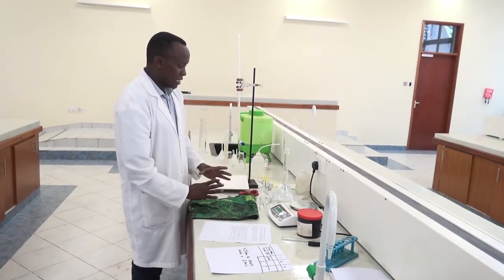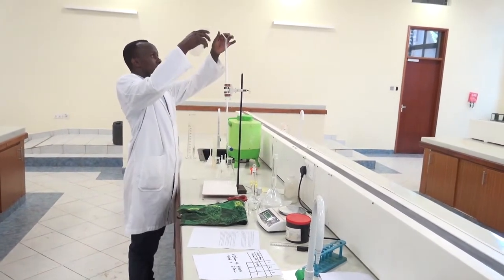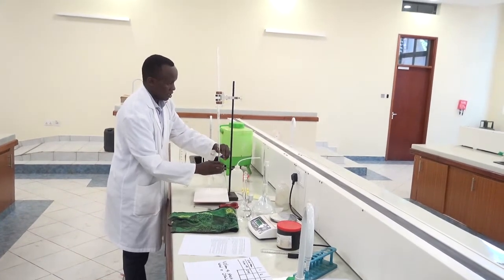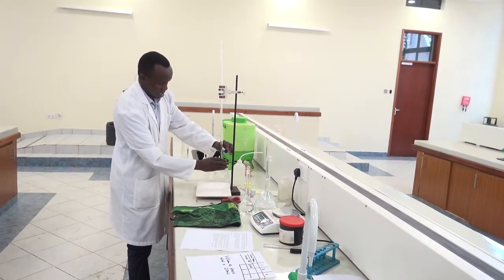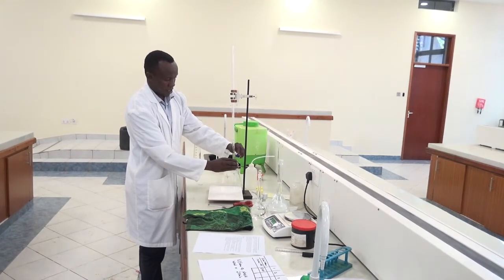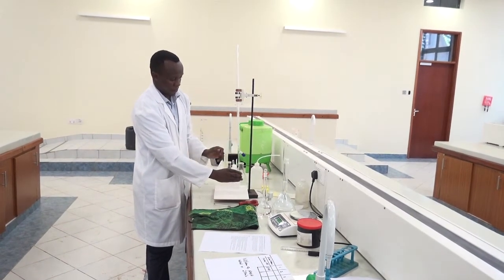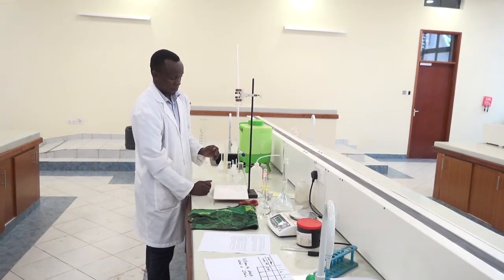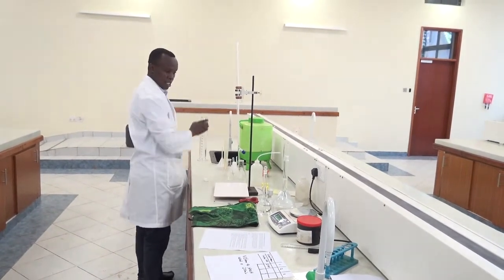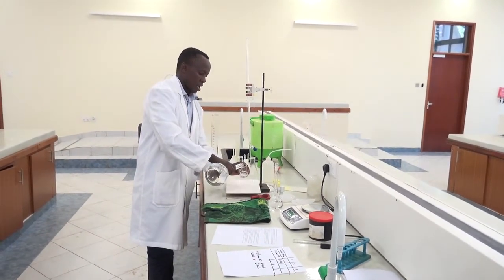Before that, I need to get my burette. I have to rinse it with some distilled water to ensure that it is clean. After that, I empty the content. I've rinsed it with distilled water, disposed it. Now I'll have to rinse it with a small amount of my HCl.